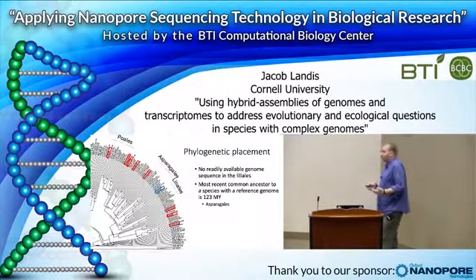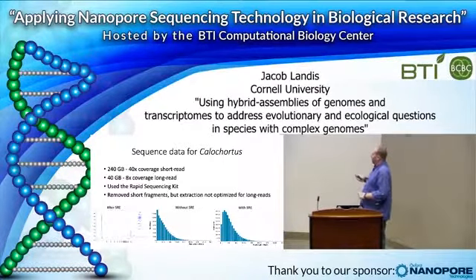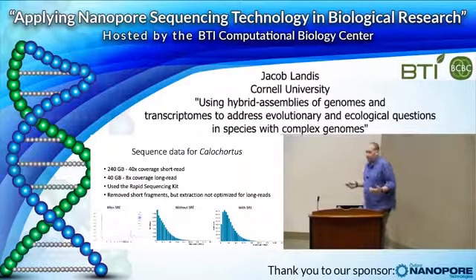sequencing kit. So again, you just take your DNA, it uses the transposase to break it apart in some cases and ligate the adapters. And we try to remove the short read fragments by using the short read eliminator, but that was talked about this morning and Fei-Wei mentioned it as well. So we ran one flow cell without the SRE. You can see that we have a really big peak on very small things.